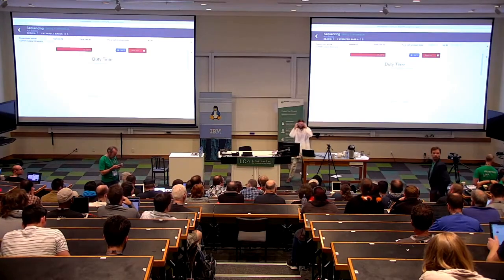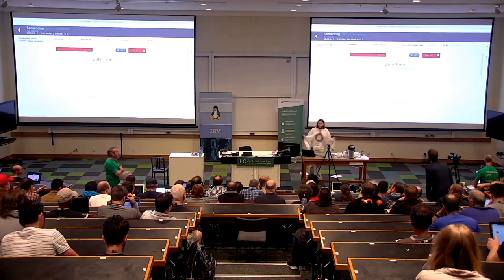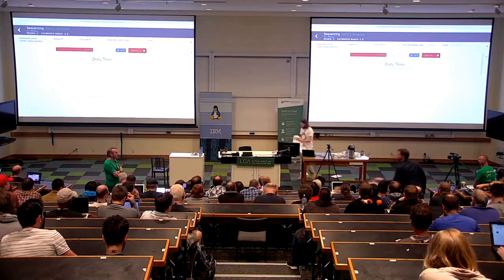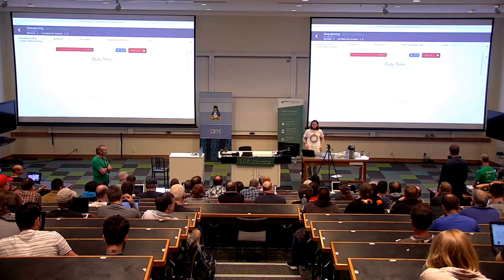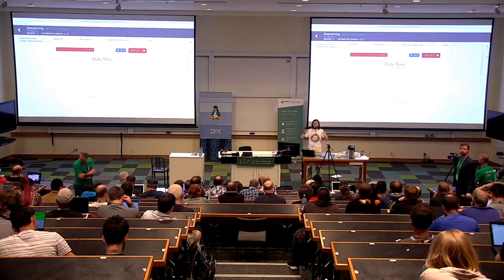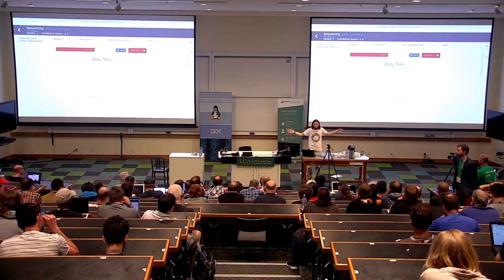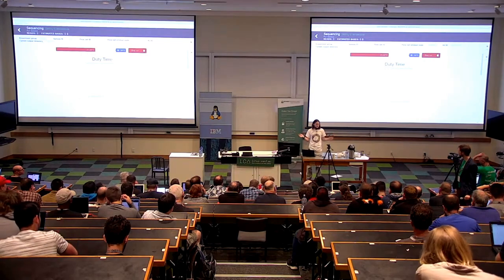Hiya. Hello. Is this on? What are the error rates like? Okay, the error rates, the DNA sequencer produces about 5 to 10% error. So that's not particularly good, but this particular sequencer has really, really long sequences, and the error rates are effectively random. And so you can sort of work around the error, even though it is quite high.